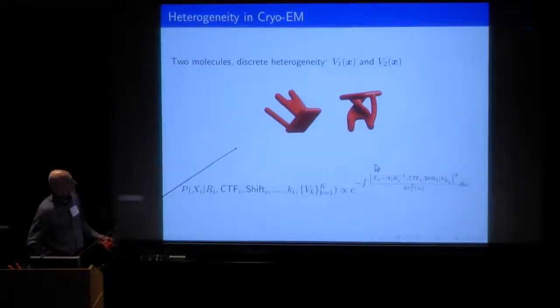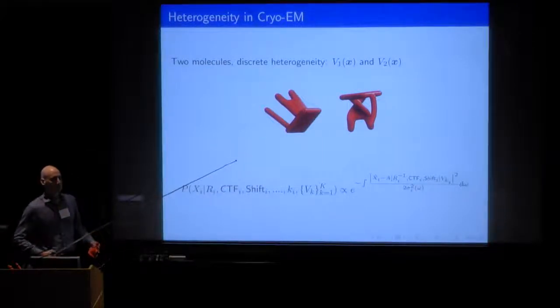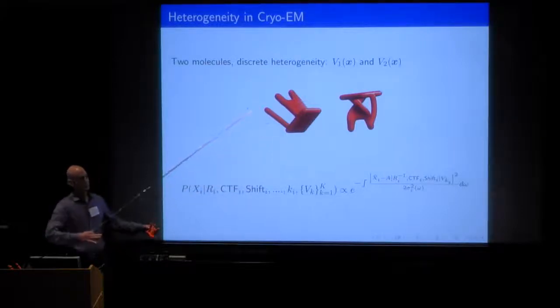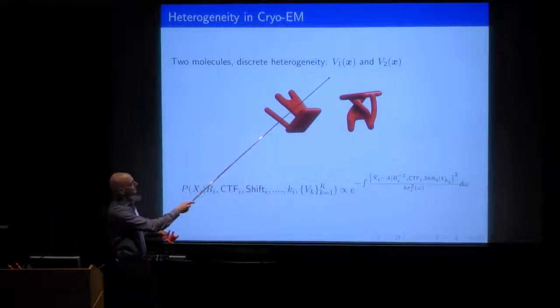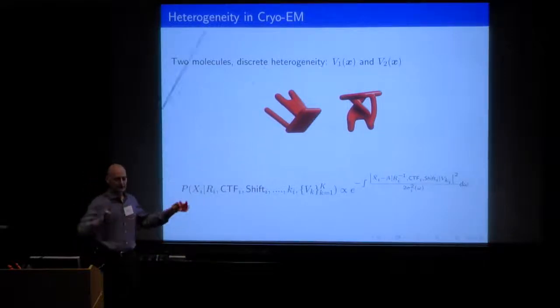So what do we usually do? The classic thing now is to think about this as having, say, two or maybe more independent objects in there. So we have volume number one, volume number two. Technically, they don't have to be aligned. They can do whatever they want.